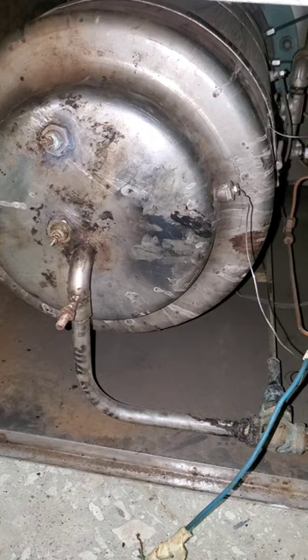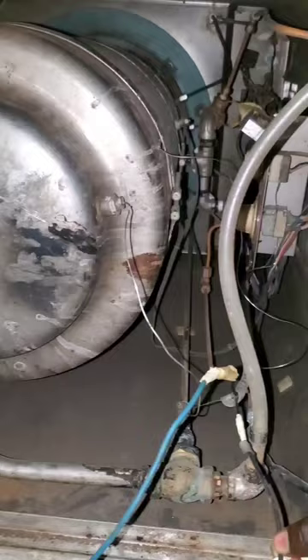This is the underside of the autoclave machine — this is how it looks. We have disconnected the heater from the terminals.